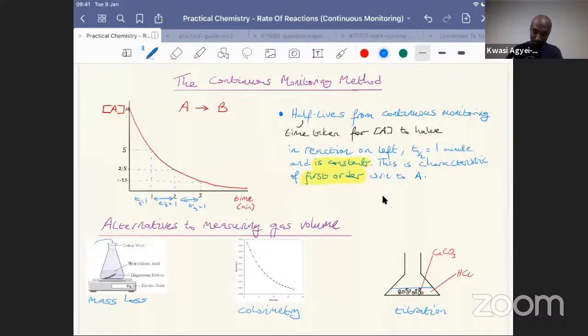Okay, so it stops HCl from... Okay, so don't be fooled by the presence of a piece of cotton wool, which in no way is going to stop any gases from escaping from that flask. It's purely there as a safety measure to stop acid from coming out of your flask as your bubbles of hydrogen burst and rise out of your solution. So that's very important to note.